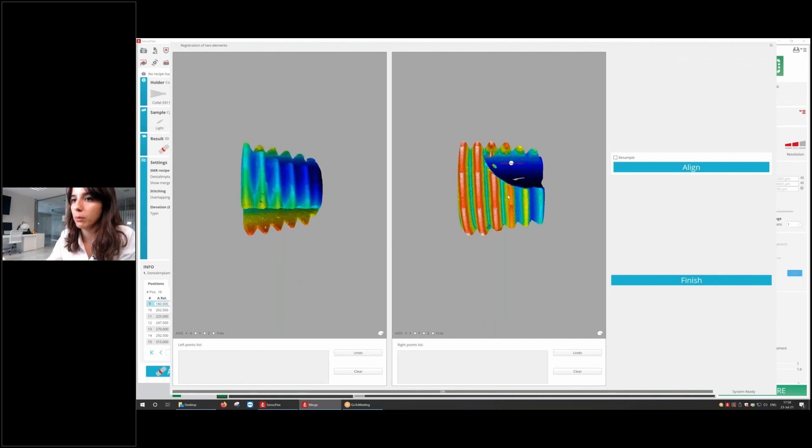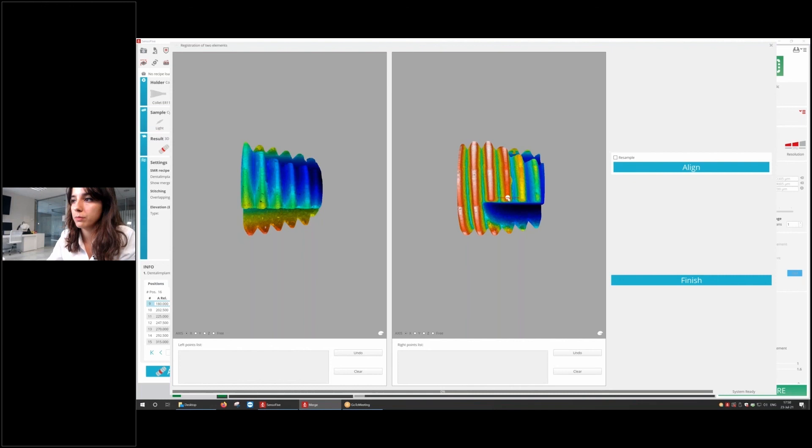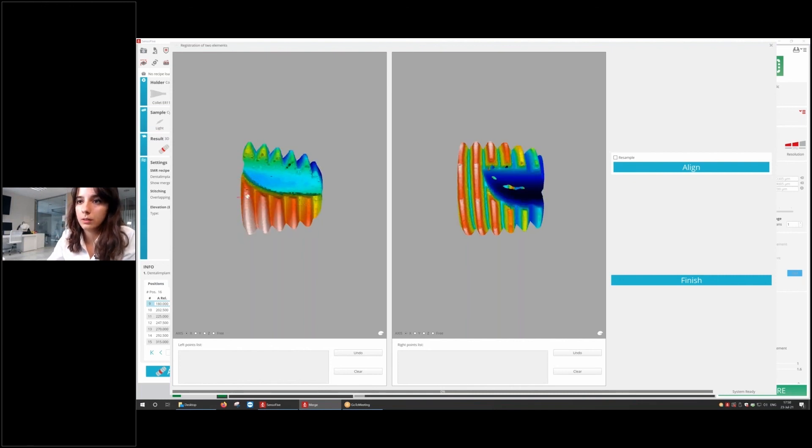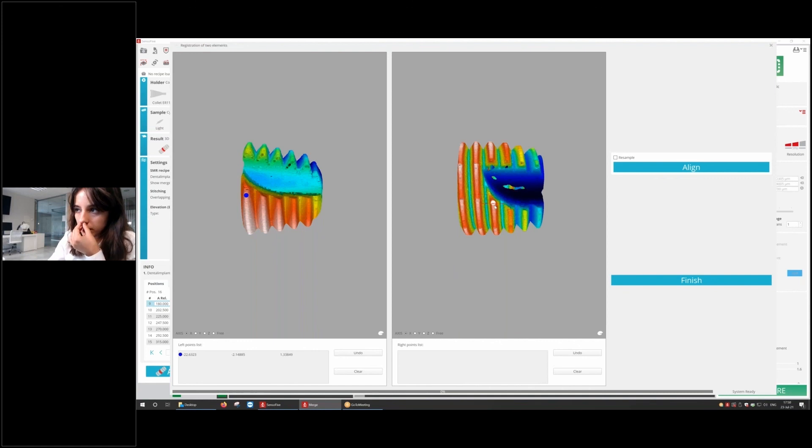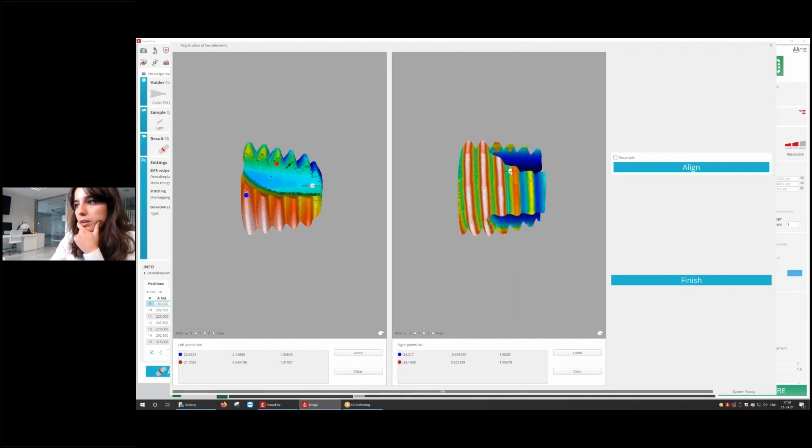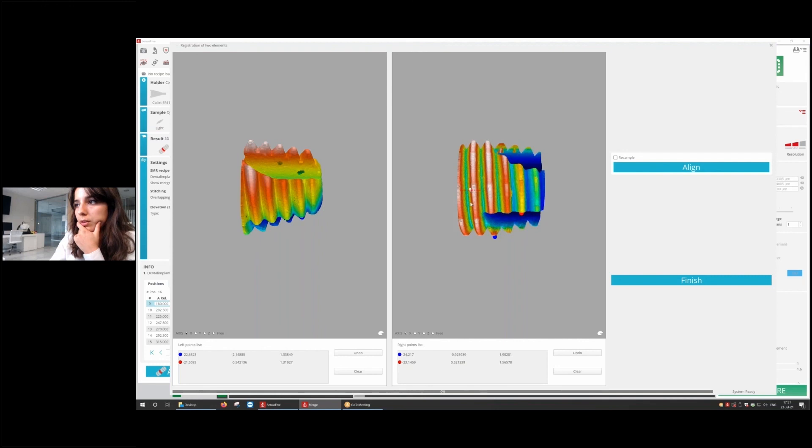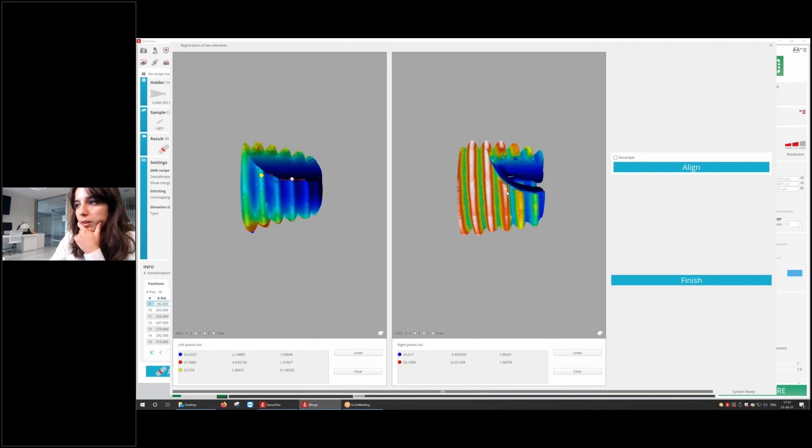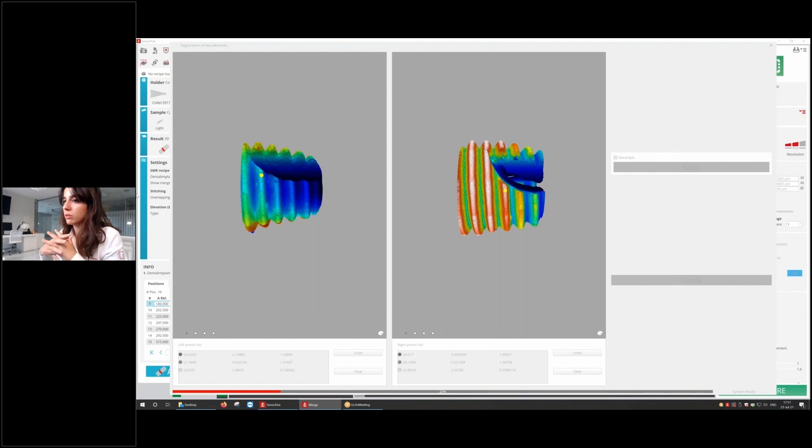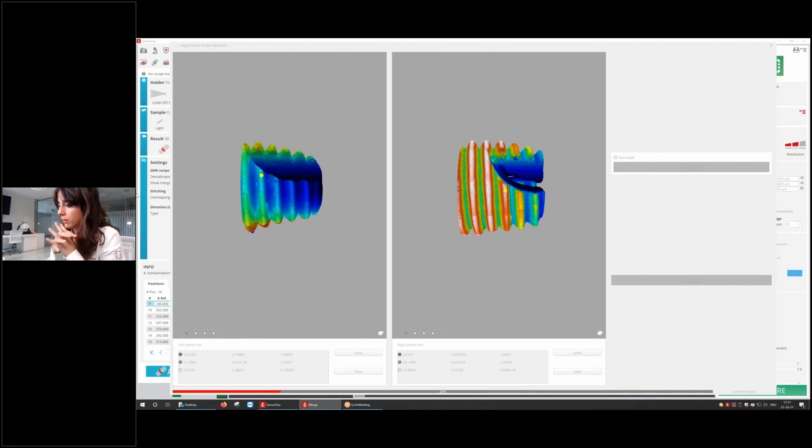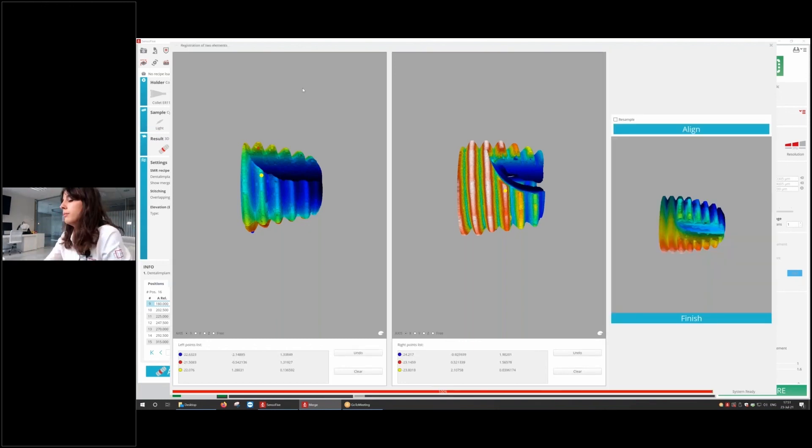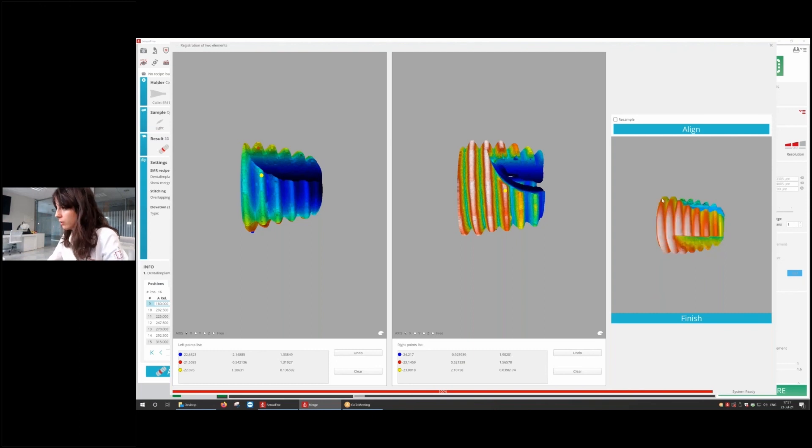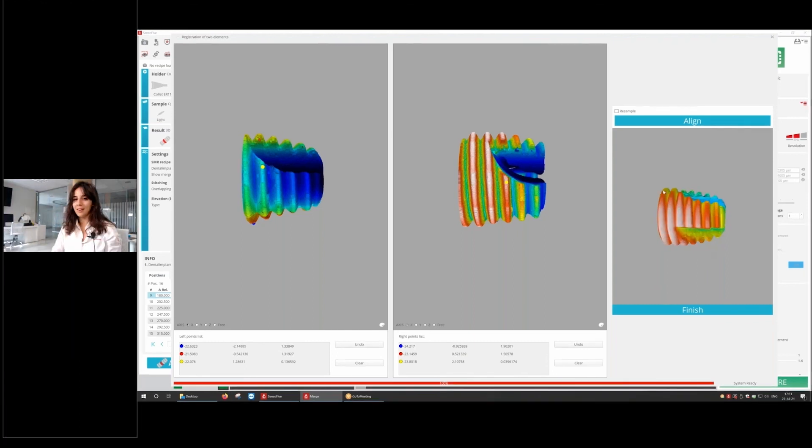For example, this is going to be the same. Then this one. And for example, we can check another part. This one. Let's click align. Now the software is going to find those similarities and finally merge the two sentences. And the result is that we have merged the two files. This is new from this version.